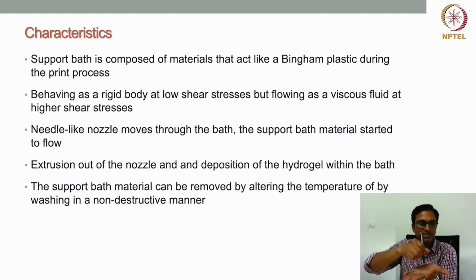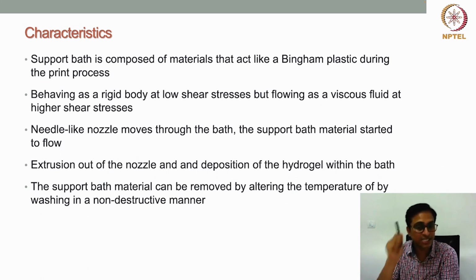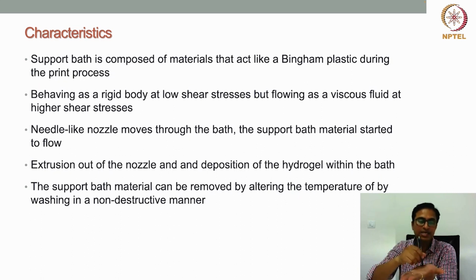But when we start moving the nozzle and apply shear stress, and the shear stress reaches the critical stress, just remember, the critical stress is called the yield stress, then the support bath material will start flowing. So it will provide space for the nozzle to move, right?